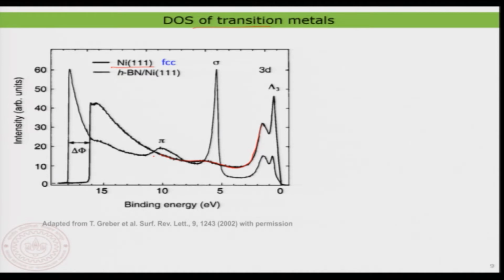What is quite striking here, again in binding energy, where 0 represents the Fermi level, is that the density near the Fermi energy no longer looks like a normal flat function as you saw in the case of gold. Instead, it looks much more spiky like this. This is quite interesting, because the nature of the density of state near the Fermi energy decides how reactive a material is.